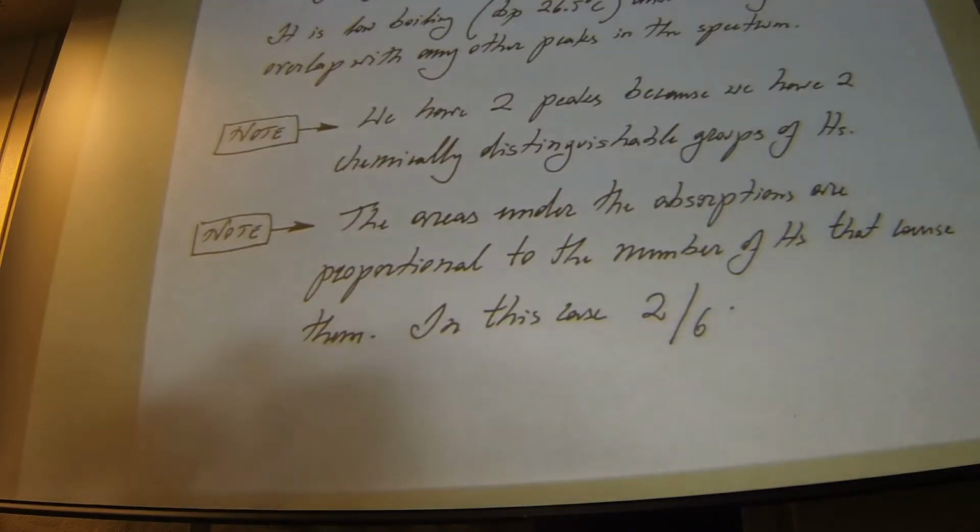Now, for the spectrum that I showed you, I want you to notice that you have two different peaks, because in that molecule, you only have two different kinds of chemically non-equivalent protons. This is important. Every chemically non-equivalent proton potentially gives you a separate peak. Why do I say potentially?